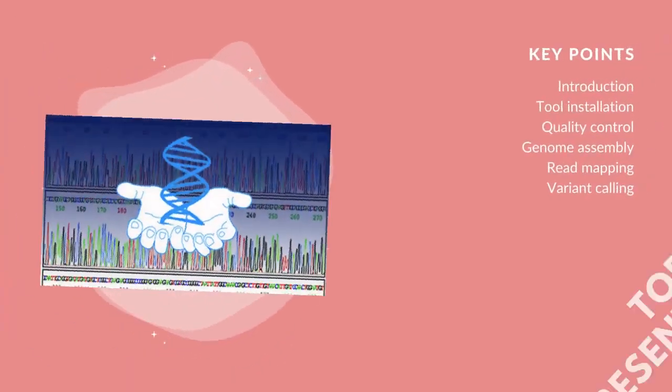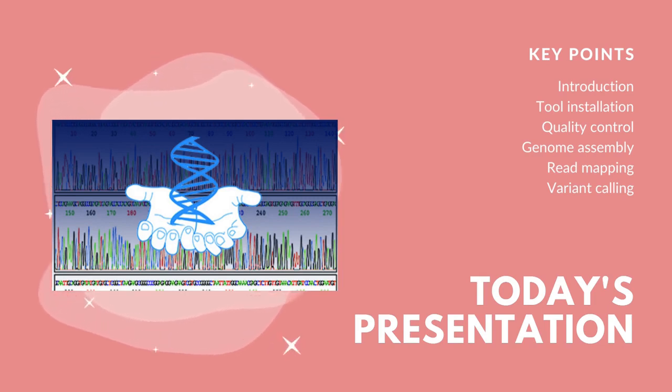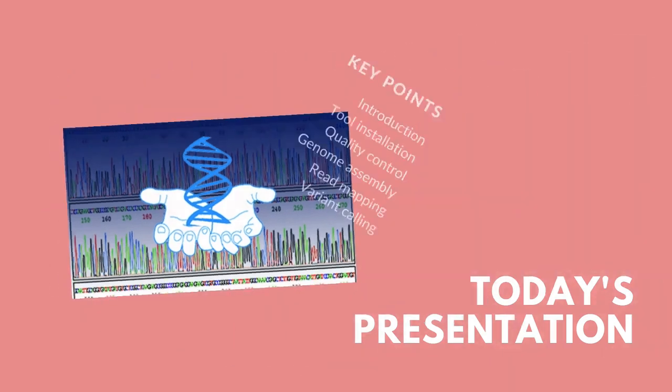In this video, we won't be performing all the mentioned steps due to constraints in time and space in my system. We'll be doing the quality control, genome assembly from sequencing data, then read mapping, where we'll map our reads from the evolved line to our ancestral reference genome. Lastly, we'll use our genome assembly based on the ancestor and call genetic variants in the evolved line.